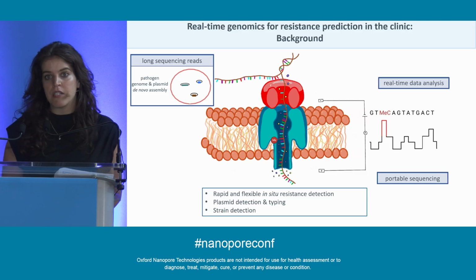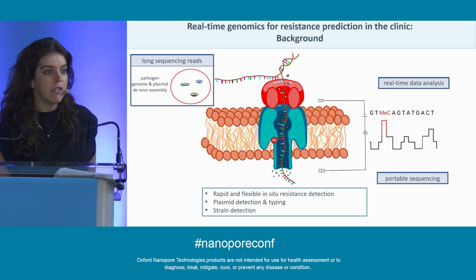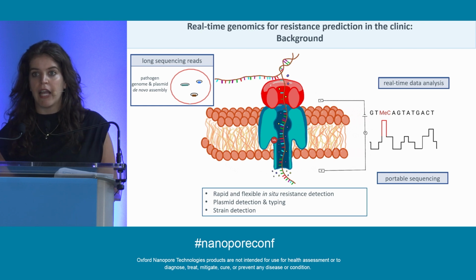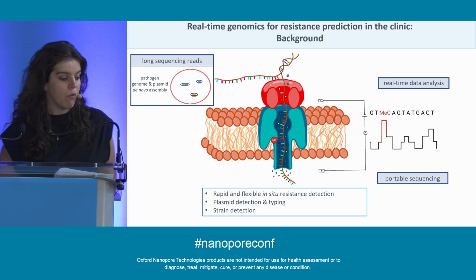However, nanopore sequencing, with its ability to produce long sequencing reads, its ability for real-time data analysis, and its portability, has the potential to speed up pathogen identification, plasmid typing, antimicrobial resistance profiling, and also strain-level detection, as we heard yesterday morning in the talk.